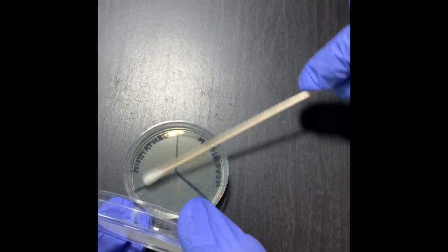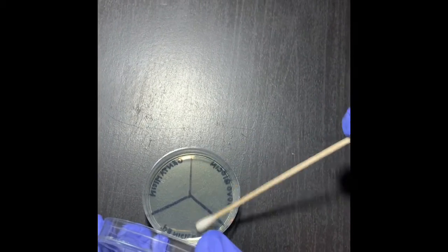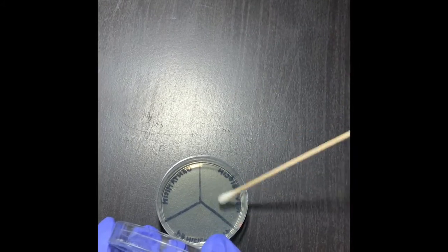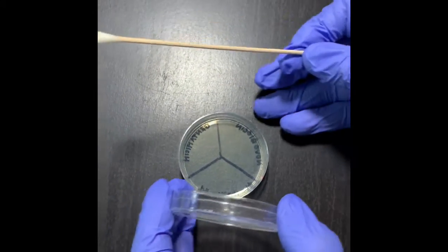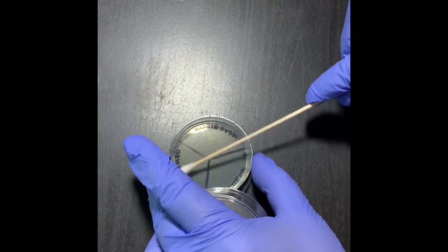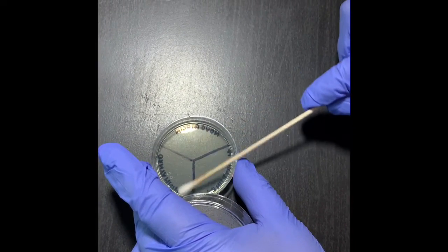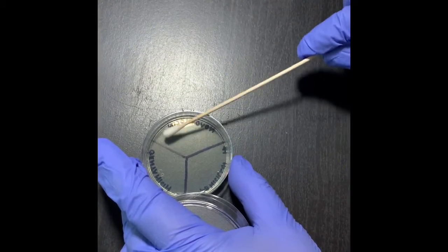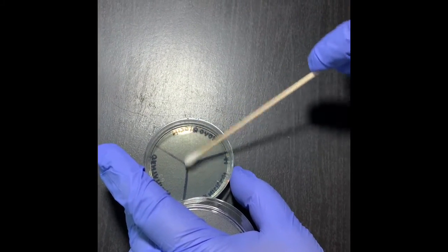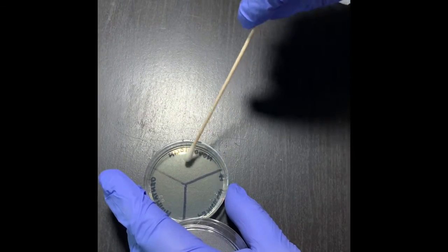I always go from top to bottom first, like how I'm doing, making sure that I'm not leaving any place untouched. Then, holding it tightly because it is a small plate, I do it at a right angle to the first streaking, so that the painting of the agar is good.